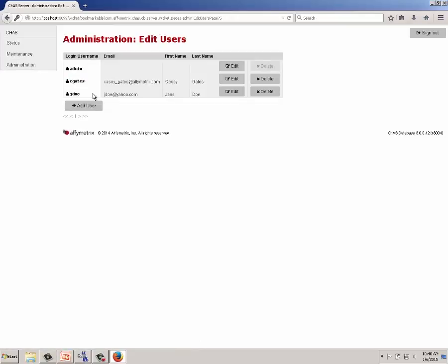And then one other comment is the default installer is admin for all ChAS 3.0 installations. So if you want to, you can go in and edit the admin password to make it something more secure other than admin, which is the default for everyone.